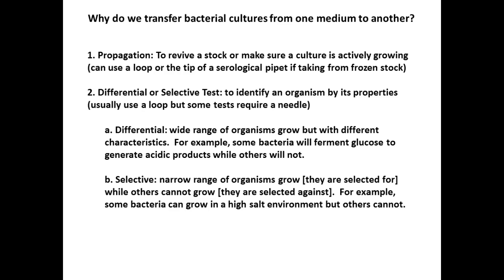Selective, as I said, will select for particular organisms. So usually we have something toxic in the media. In the case of the blood agar ones, it's antibiotics, right, which are going to kill the gram negatives and allow us to grow the gram positives.